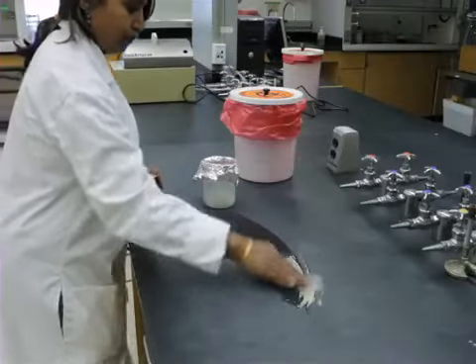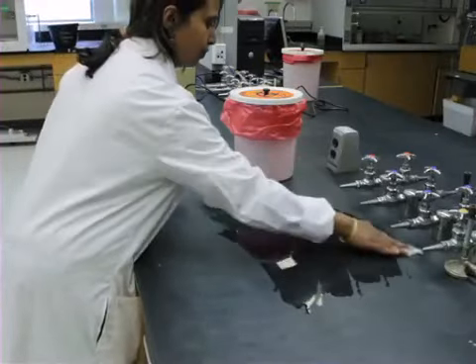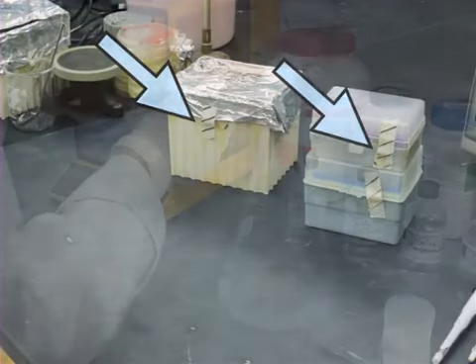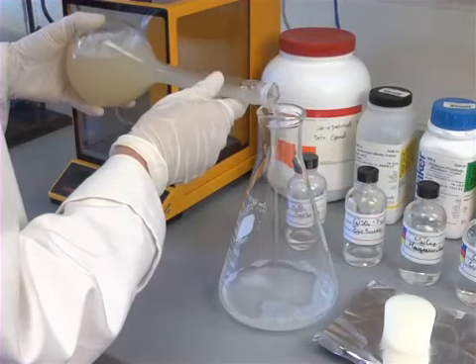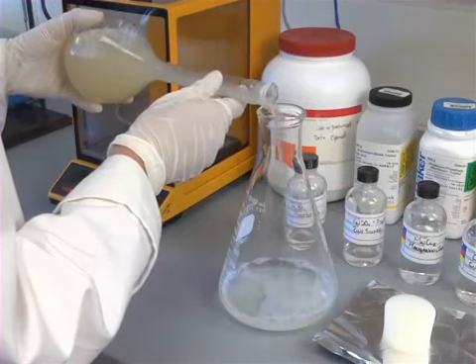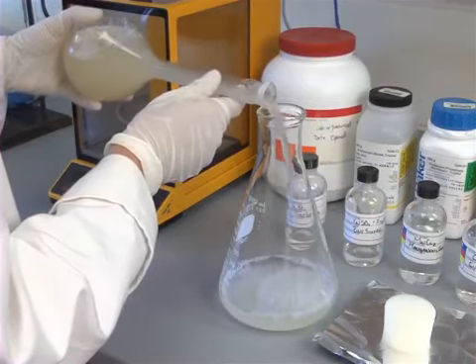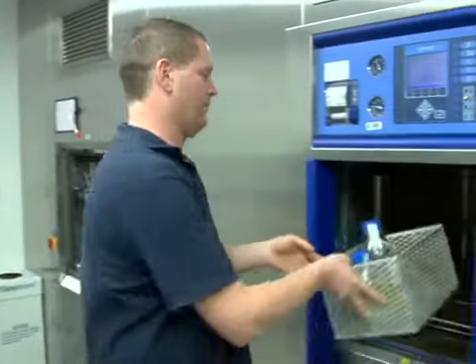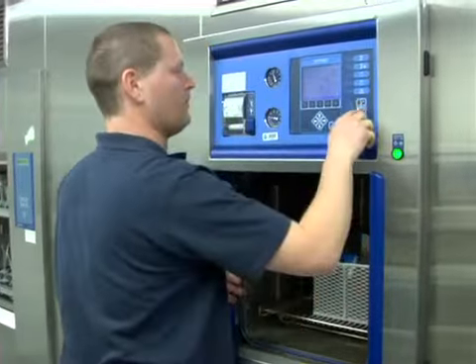Before starting heat shock transformation, clean the work area and make sure all equipment is sterilized. Ensure that you have enough media and agar prepared, which provide the nutrition to the bacteria you will make competent. Also be sure to sterilize all solutions via autoclaving.